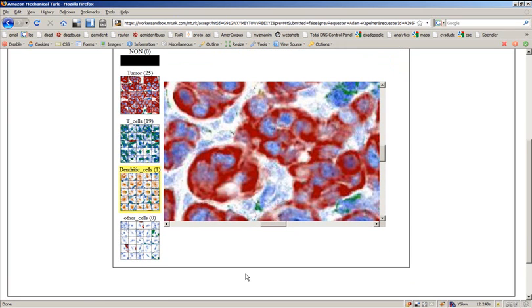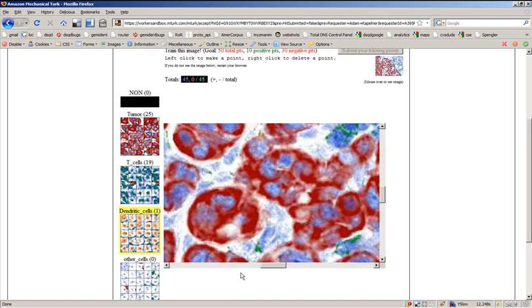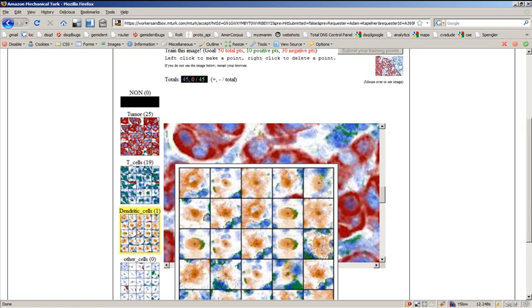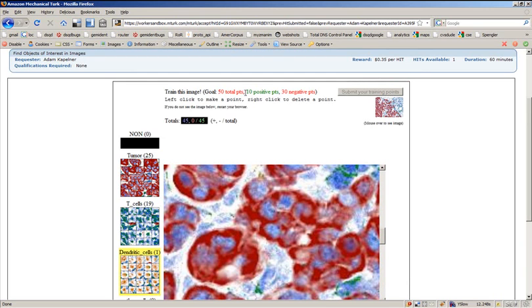Remember that many types of images are distributed to DistributeEyes, and not every image has each phenotype. It's not required for the user to make training examples of each phenotype. That's why we only require a certain number of positive points, just in case those phenotypes don't exist.